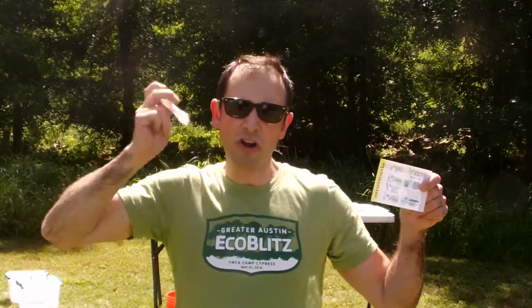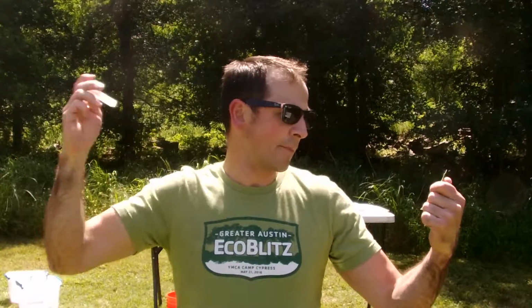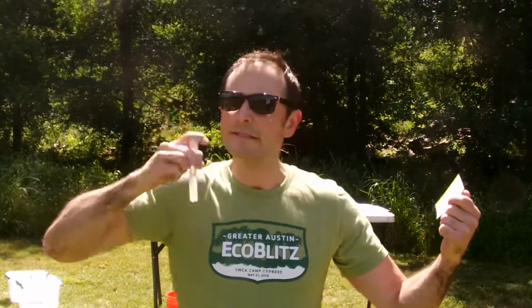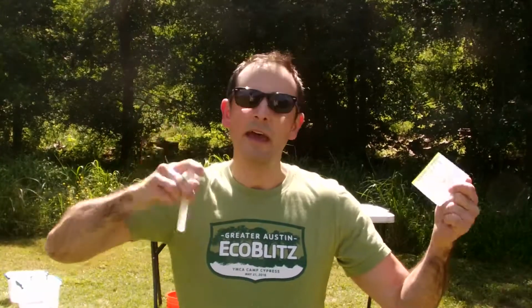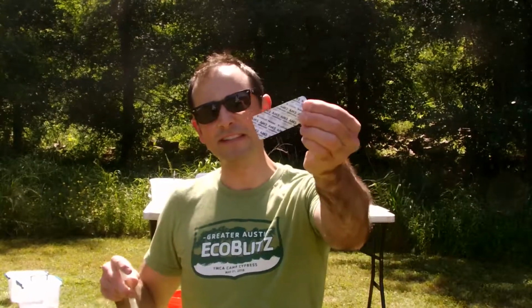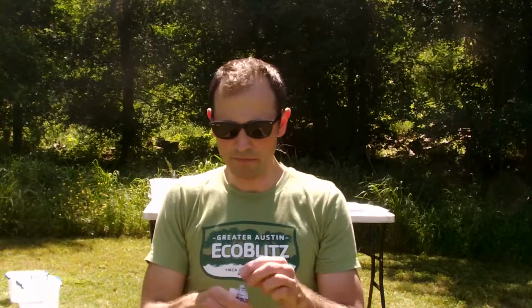These instructions are also on your card as well that the kids will have. So, add 1, cap, tube, mix until tablet has disintegrated. We're almost there. It's coming, it's coming, it's coming. Then we're going to add number 2. Now on the pack, on the full pack, you'll see it says number 2. Alright, I think we're good.